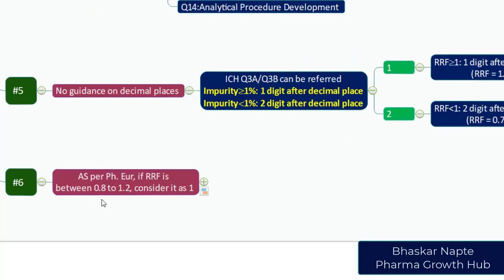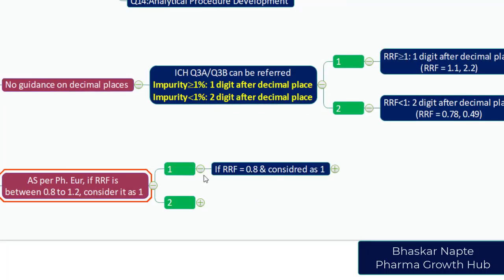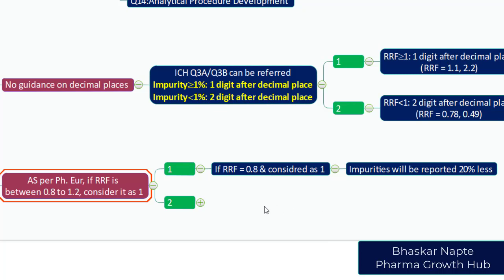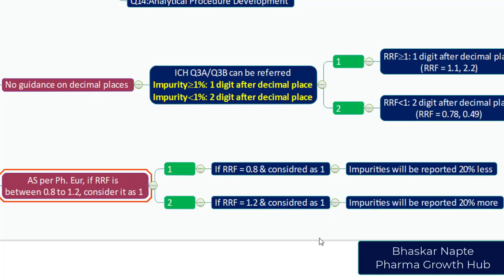Challenge number six: the PhEur guideline states that if the RRF is between 0.8 and 1.2, consider it as 1. Understanding the implication: if your actual RRF is 0.8 but you report it as 1, you will end up reporting impurities 20% less than actual. Conversely, if your RRF is 1.2 but you treat it as 1, you will end up reporting impurities 20% more than actual. These are the significant consequences of the PhEur guidance.